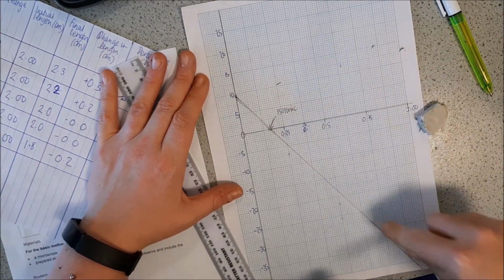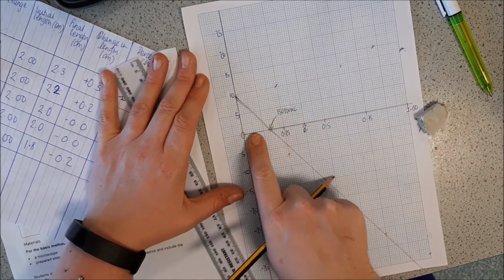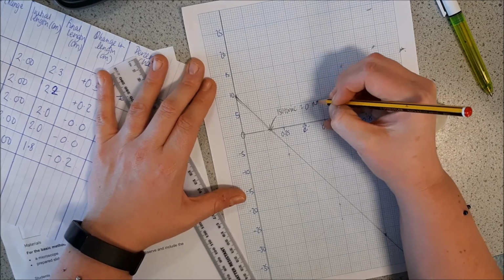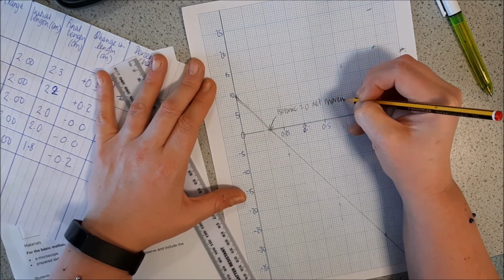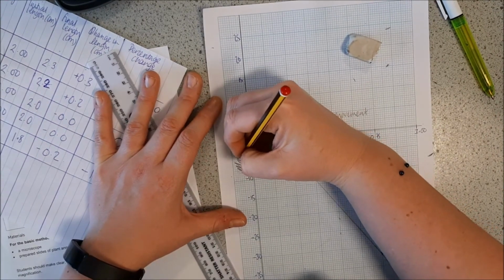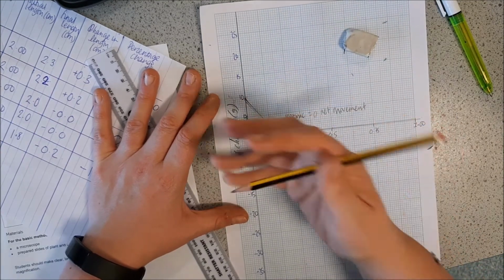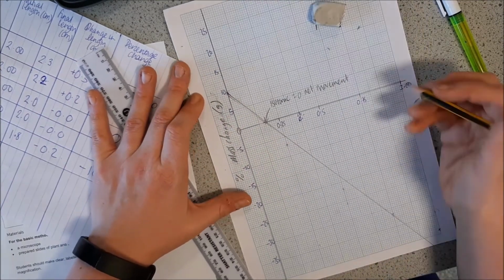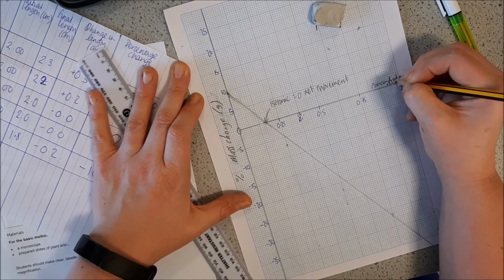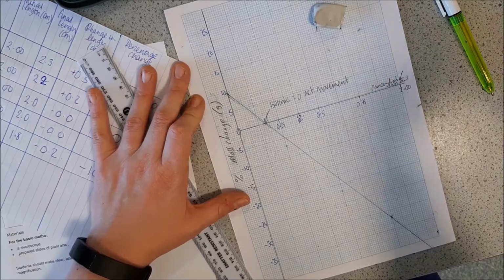Now, it took me a few goes. I misplotted one. So it's small crosses, and then we find the point where it's isotonic, so that we are at an equilibrium. So we would have zero net movement. Mass change, percentage, and then concentration, moles dm cubed. A graph to show. Bazinga.